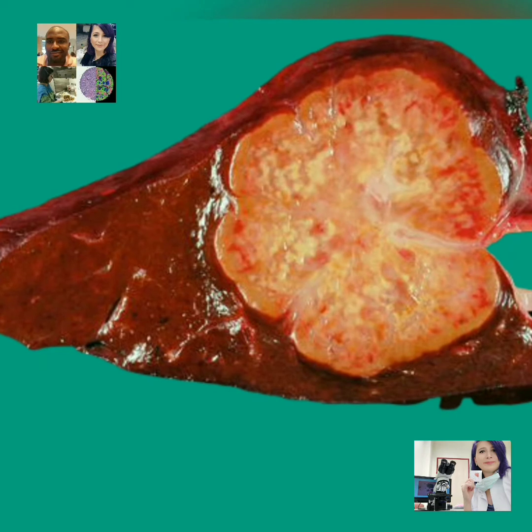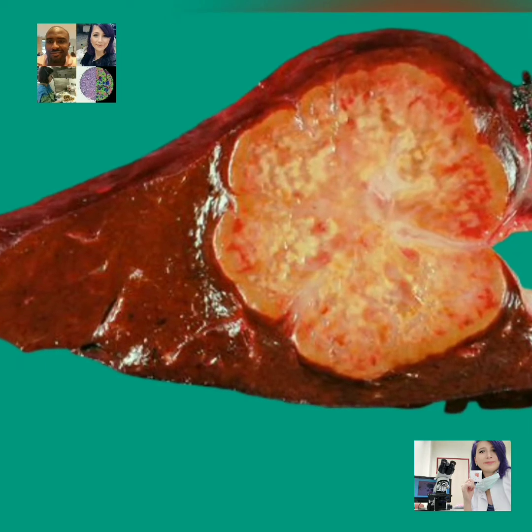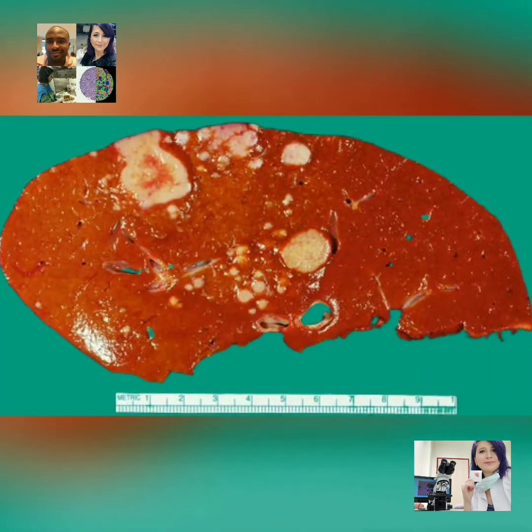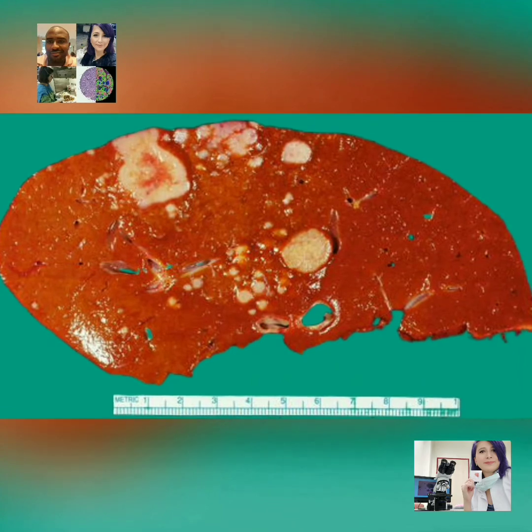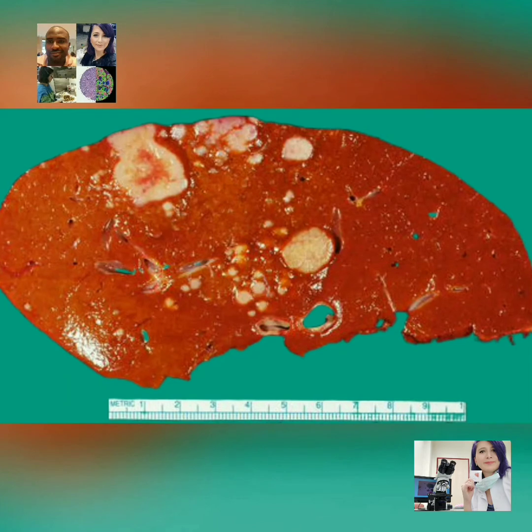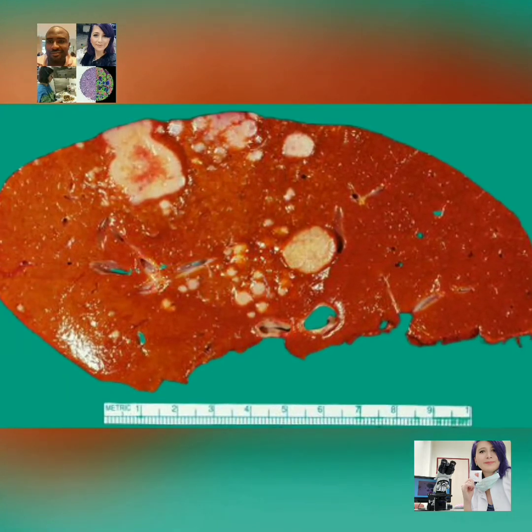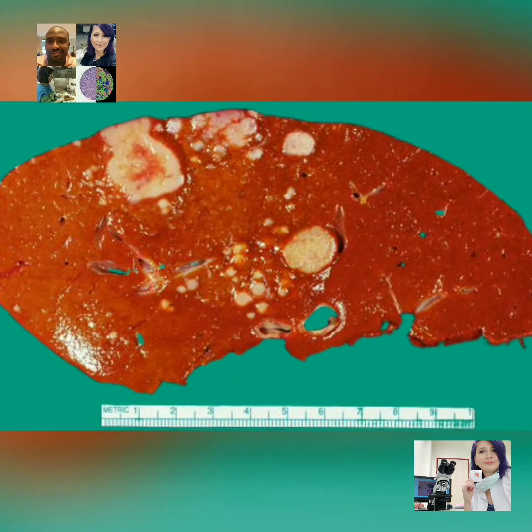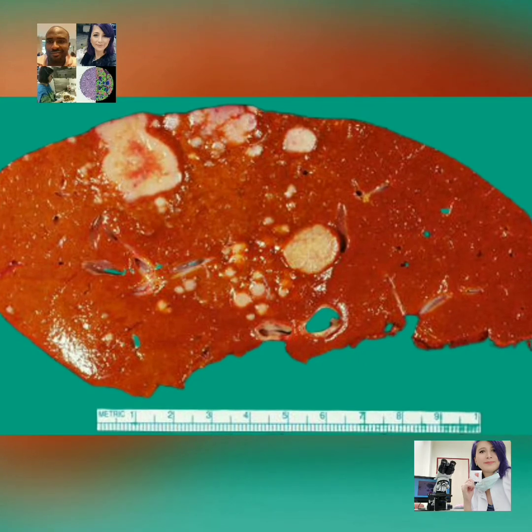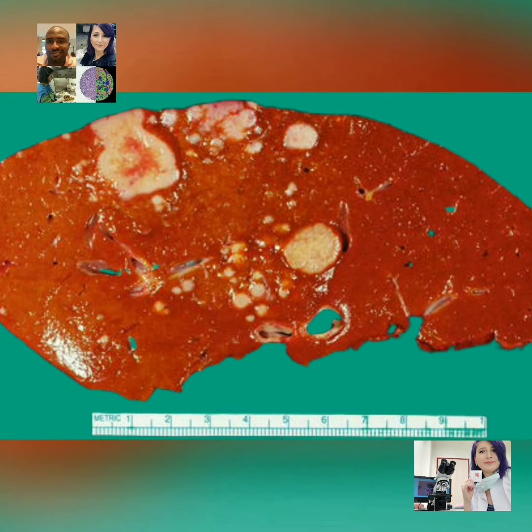Next comes the fun part, which is dissection of the sample. The samples are usually sectioned perpendicularly to the parenchymal resection plane. This facilitates correlation with radiology where possible and when necessary. Some huge masses may require extended fixation of their cut slices in formalin. The cut surfaces may show a variegated appearance, ranging from hemorrhagic, jaundice-tinged liver surfaces to relatively circumscribed nodular masses.